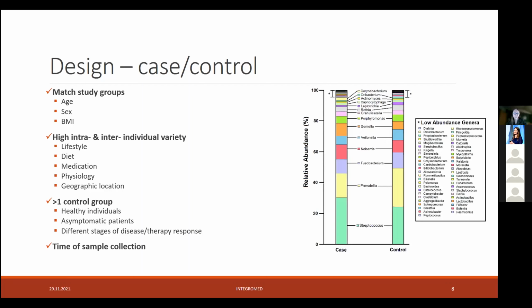So we know that, for example, if we need a whole year to collect samples, then we should collect controls in some cases in June and in some cases also later. So the seasonal effect is not so pronounced and doesn't impact your results so much.